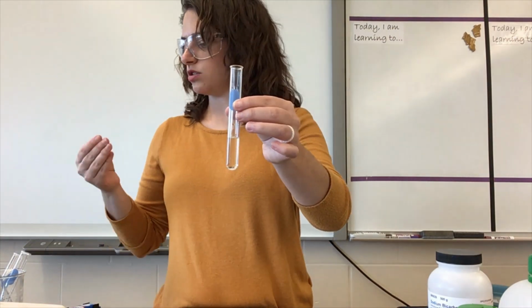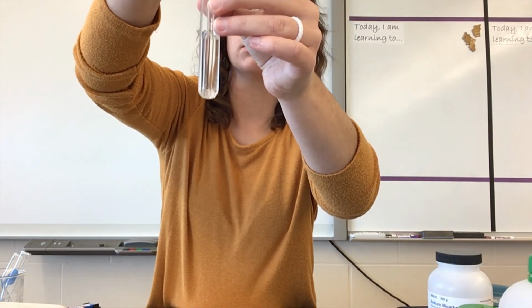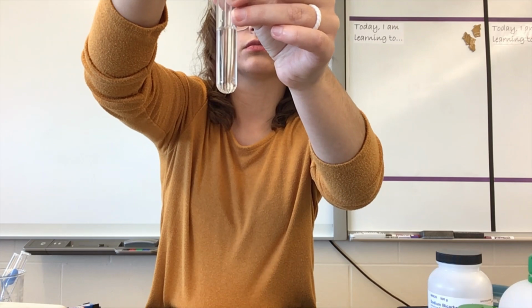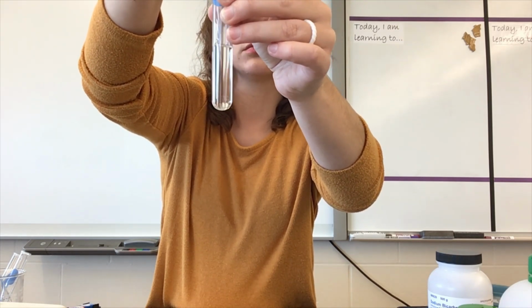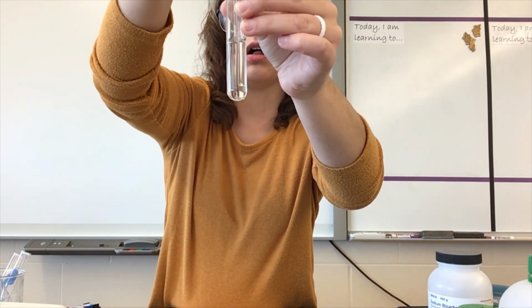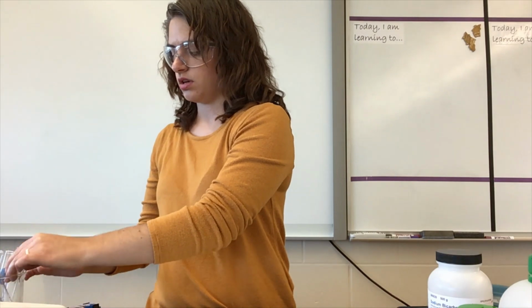So put some in my test tube, add some water, give it a stir. And it's definitely soluble. It all dissolved in water. Okay, so my sucrose is soluble.